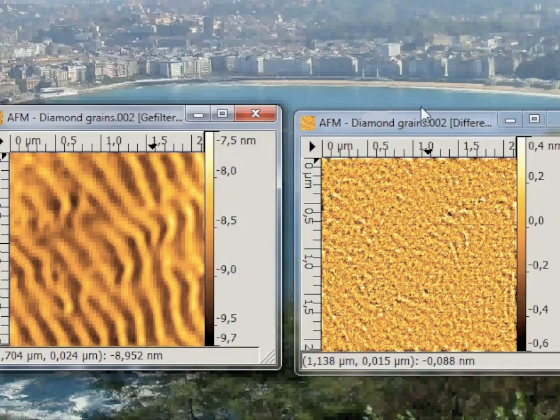So if you think about what we just did, it's quite amazing. With almost no effort we could separate these different data and can now analyze them separately further if we want.